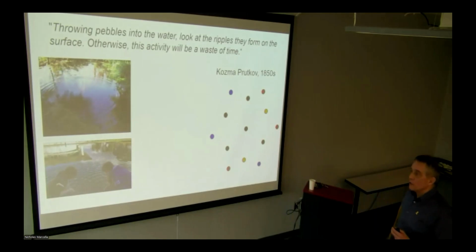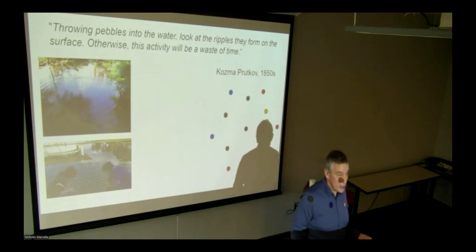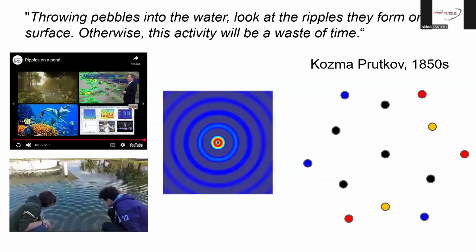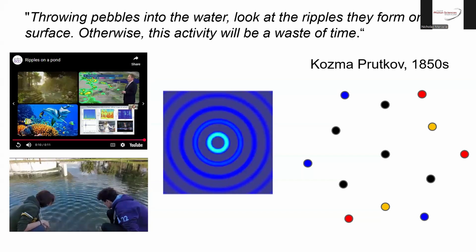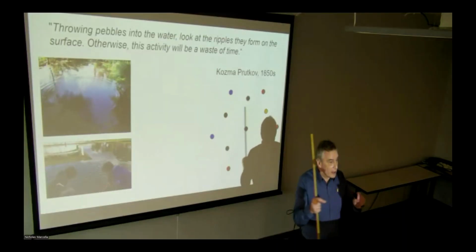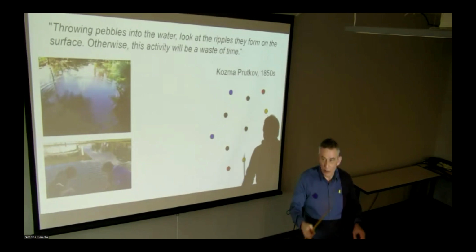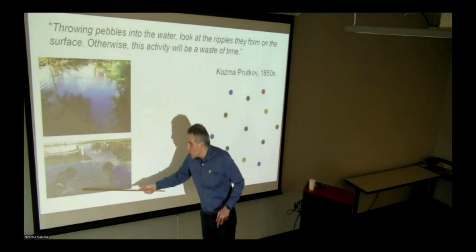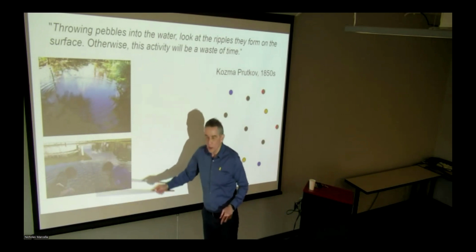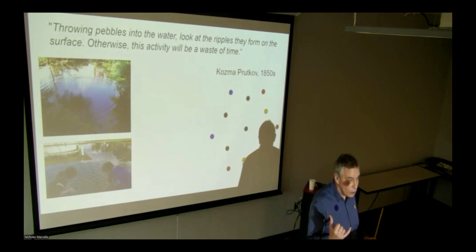And in principle, if you use it as a tool, like any tool involved in wave interference, it's used based on the same principle: you can measure interatomic distance in the material if you have a probe that does this waving type of motion, right? Because by applying this to different geometries in which the distance between the atoms is different, the interference pattern will change. So if you want to measure this distance, you just look at this interference pattern and connect it to this distance. And if the distance is longer or shorter, the pattern will change. So there is a connection between how the waves interfere and what the distance is. So that's why it's a good structural tool, conceptually.